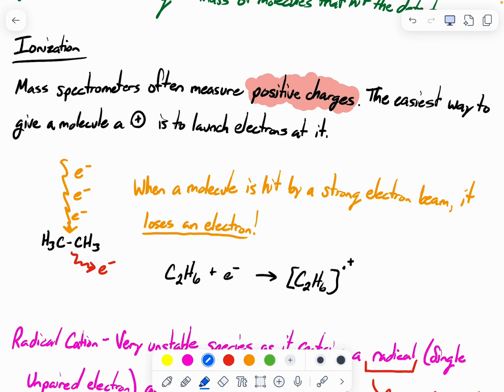Radical cations are really weird because they don't really exist outside of mass spec, right? The other thing that you can keep in mind that we've ejected here is that other electron. So we now have a pair of electrons that goes off into the ether and they get dealt with later on.